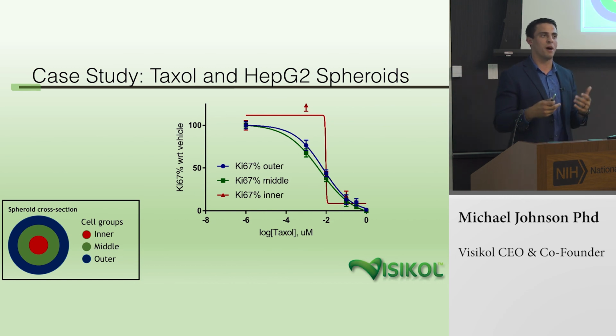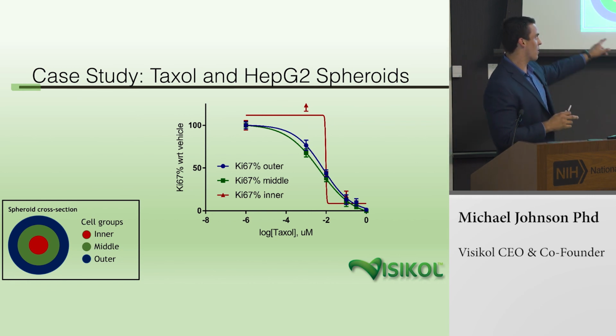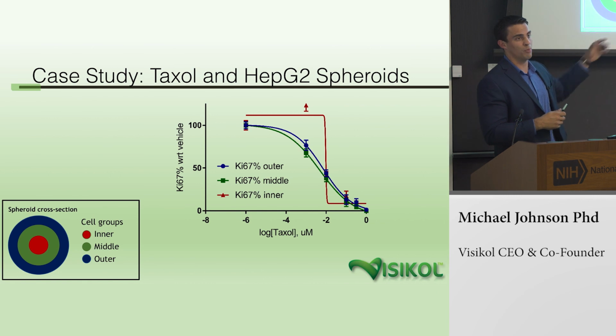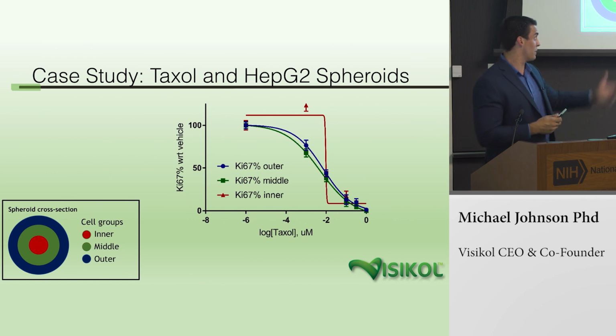So if we have a solid tumor model, we want to make sure that our antibody is actually getting to where it's supposed to go and understand the kinetics of that penetration. So this is why, and it's not always the case, but there are cases where generating 3-dimensional data and understanding in a 3-dimensional matrix what's going on is incredibly important. So a lot of this data that we process and we generate, we actually do outside of the CX7 software, just in regular ImageJ and CellProfiler pipelines, but it allows us to take the data and really play with it however we want. It comes out as TIFF files, and we process it, turn it into these insights for our clients.